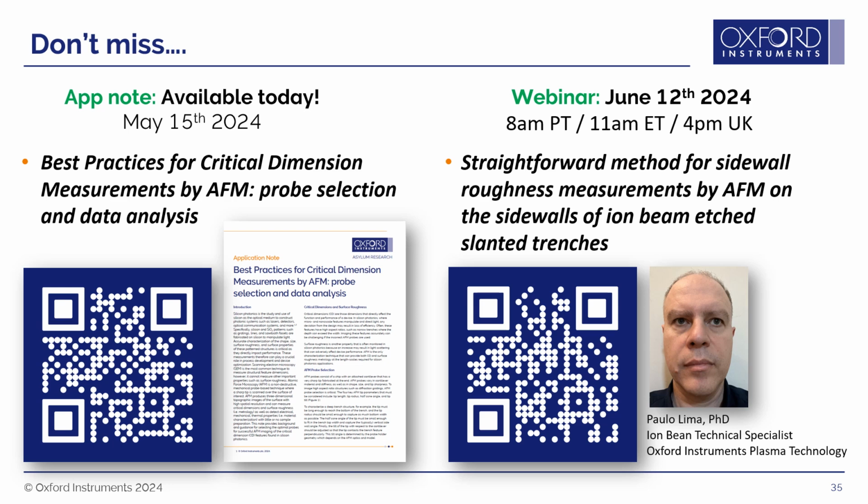I guess the other consideration would be the maximum scan size. For Cypher, that's 30 microns in XY range versus 100 microns XY range on a Jupiter, which obviously imposes a limit on how large of samples you can look at in a single image. Other than that, really all the considerations are the same. Cypher supports all of the same imaging modes. It also features Blue Drive as well. So you can absolutely image these types of samples on a Cypher as well.